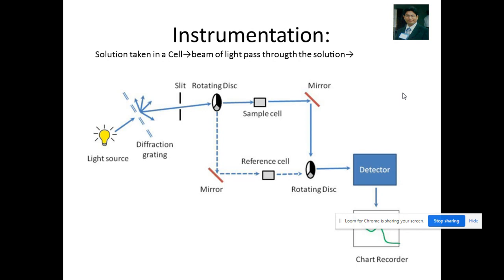The signal for the intensity of the absorbance versus corresponding wavelength is automatically recorded on the graph. The spectrum is usually plotted as absorbance against lambda.